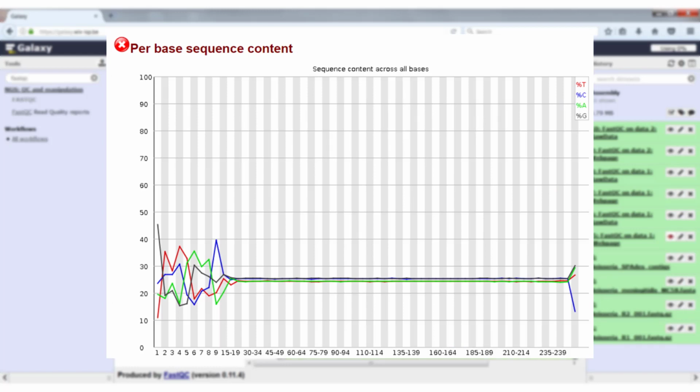This is because we have this non-random distribution of A, C, G and T in the first part of all reads. If the DNA would be cut completely at random before sequencing, you would expect approximately the same percentage of nucleotides over all reads at every position, somewhat like the rest of the graph.